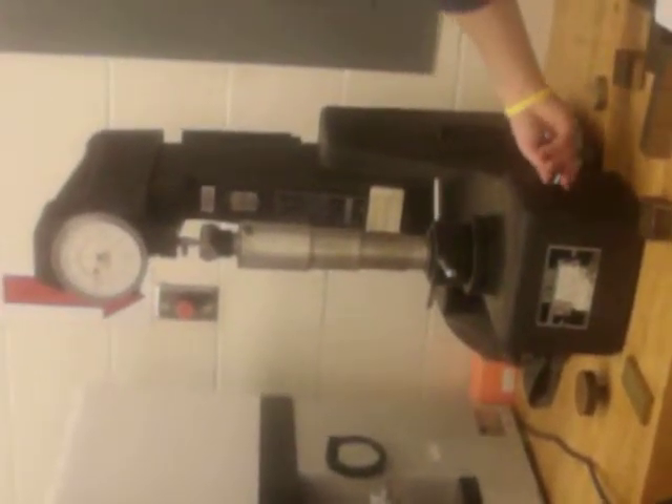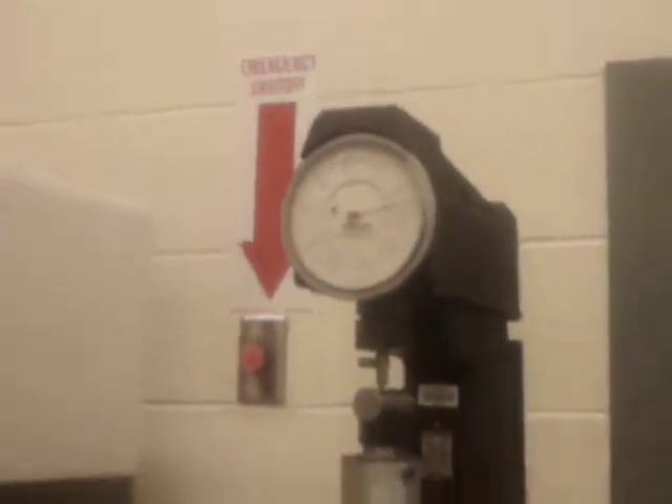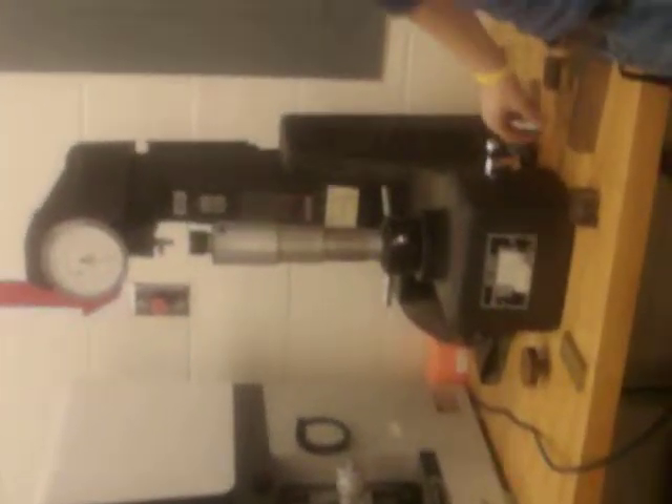The needle. And then flip it back. And then, that's your reading. And then, you loosen this up, take it off, and then you test it.